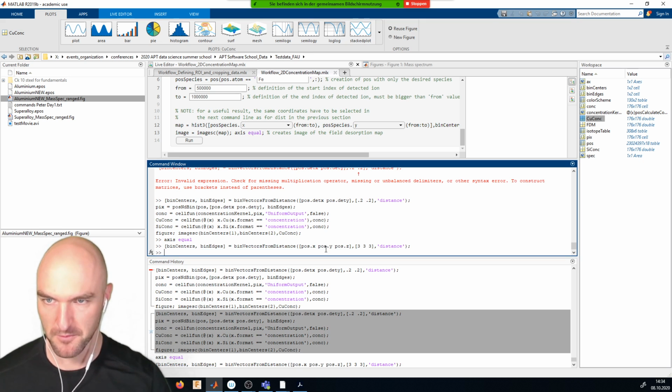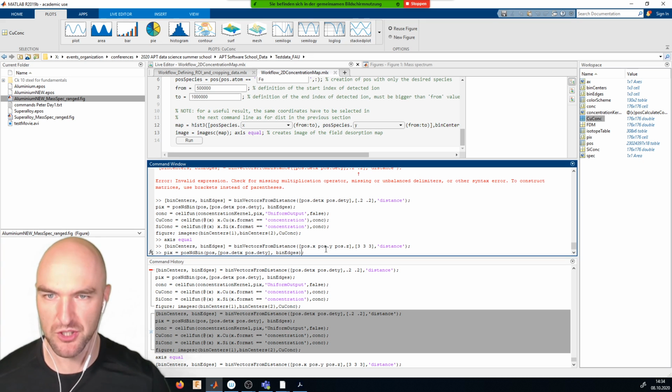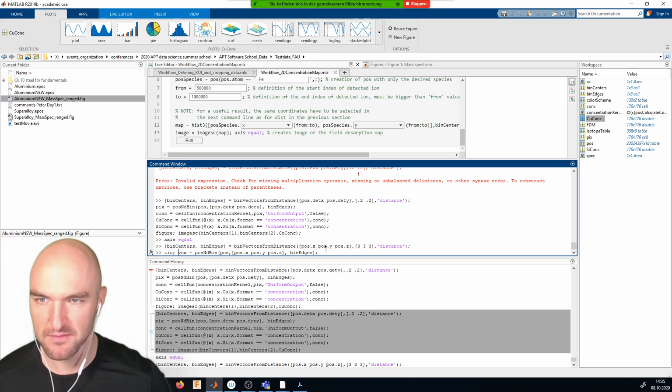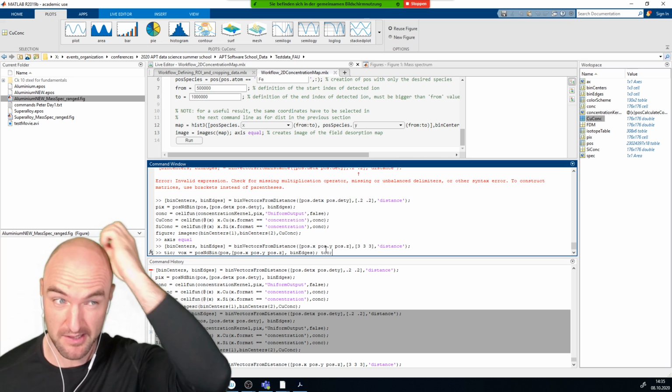And now I will actually do the pixel function as a voxel function. I'll call that voxel, and a voxel is just a volume pixel. That's where it comes from. And the pixel is a picture element. And what you will see is that this is not really the fastest way to do it.